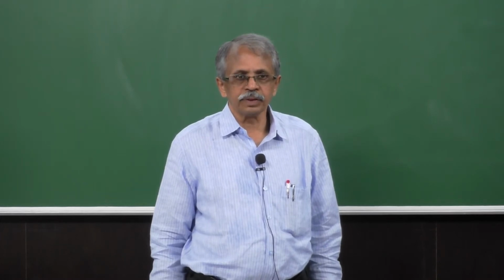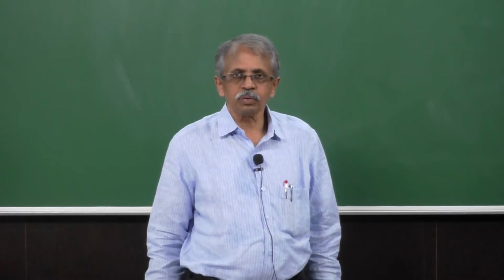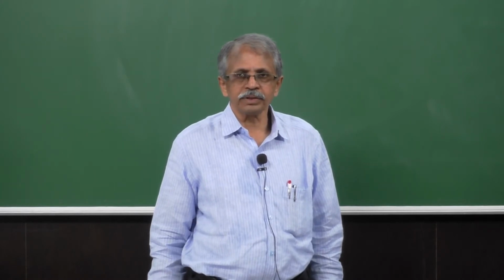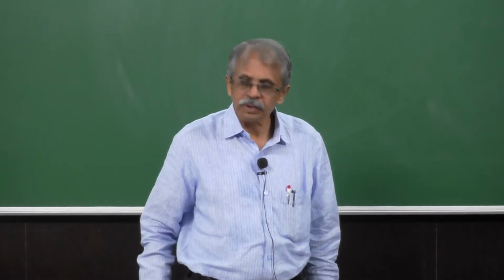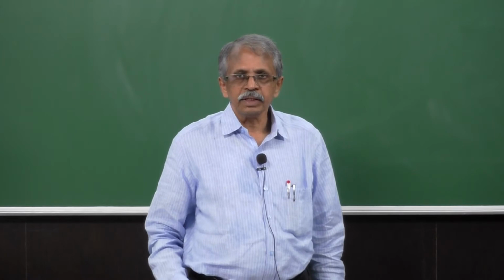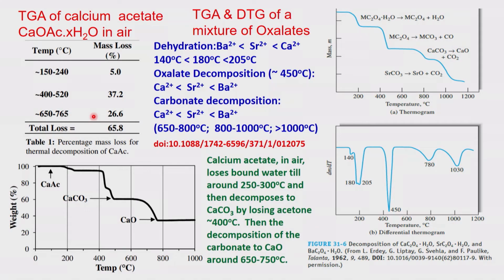Let us continue with it. I've already explained in that class how to look at the thermogram and get the peak points, the weight losses, and their calculation, all of those. Now let us continue with that to understand better. If you use it for some kind of a mixture situation, can we use this?